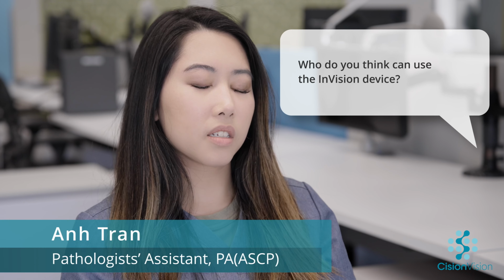I think this device is designed to be used for everybody, any level of experience. It's made to be simple enough so that you, as the prosector, can dictate how the device can be used, rather than the device dictating how you need to change your workload to use it. New residents and PAs can use the device to help them gain confidence and experience when it comes to lymph node dissections, especially the first few times, because lymph nodes can be tricky.